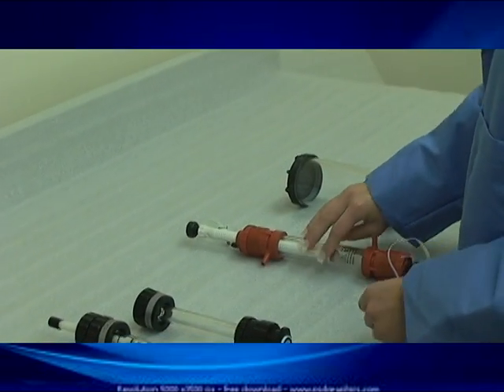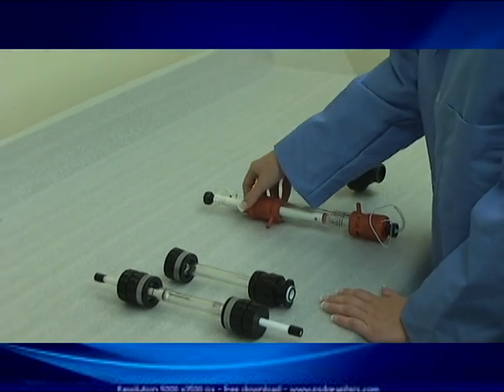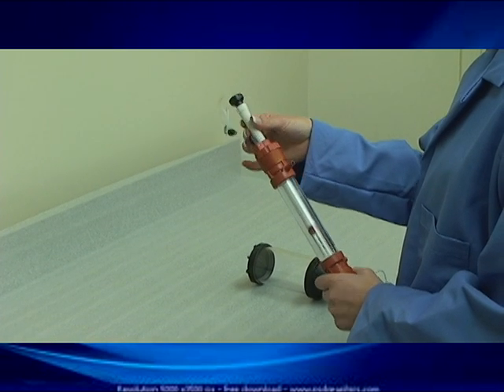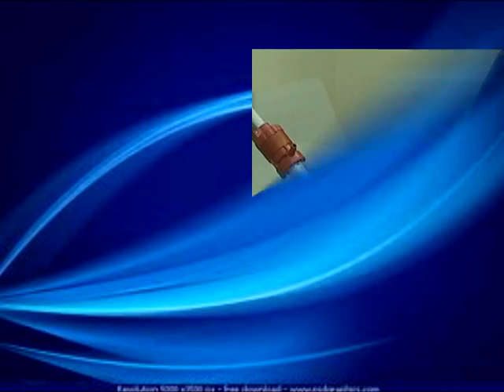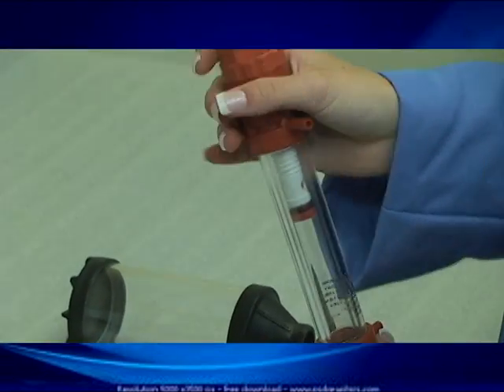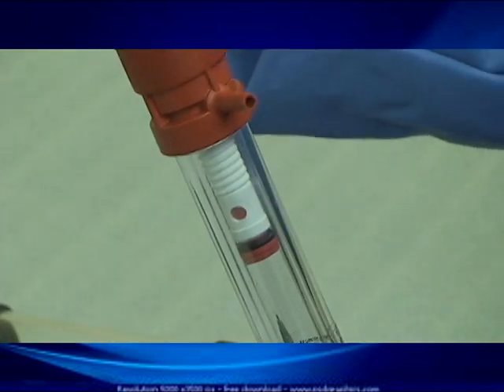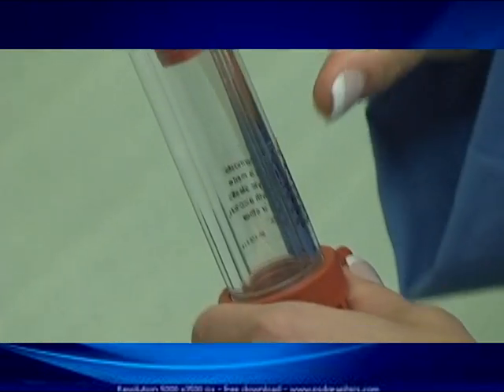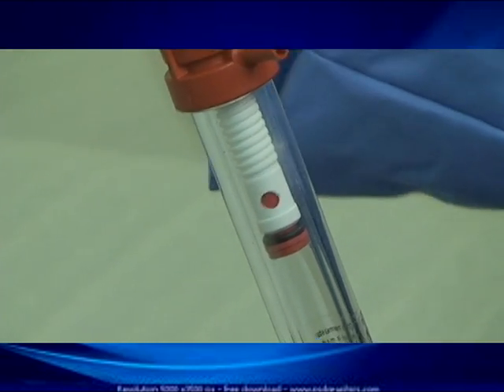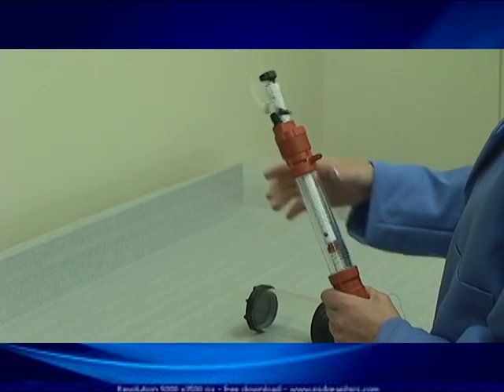First and foremost, we believe at Essential Life Solutions that linear motion of the piston is key to good chromatography. In trying to move a piston in a movable piston column, two methodologies can be employed. On our comparative column, we will be turning a screw. As you can see in the video, the nut is fixed and only the piston is moving. As the piston moves in and out, we are actually turning the piston, which creates a problem with the packed bed. As we come down onto the packed bed, we are going to be scraping the resin surface.